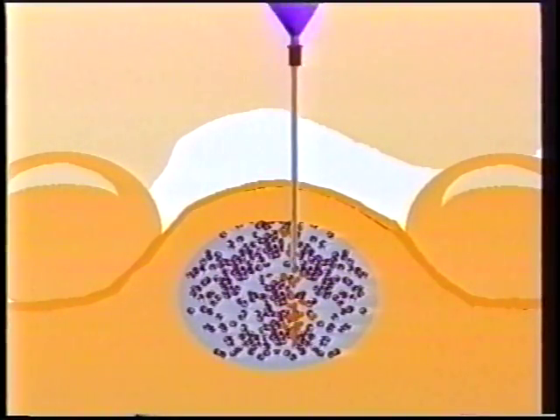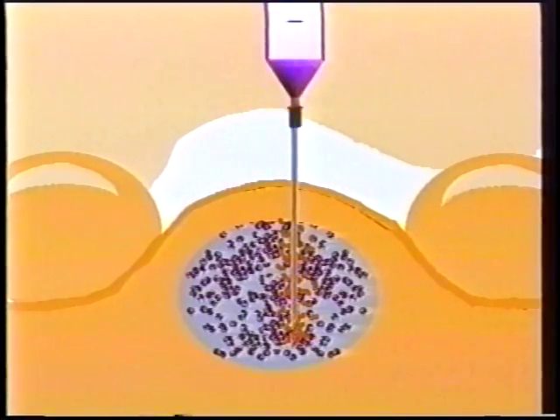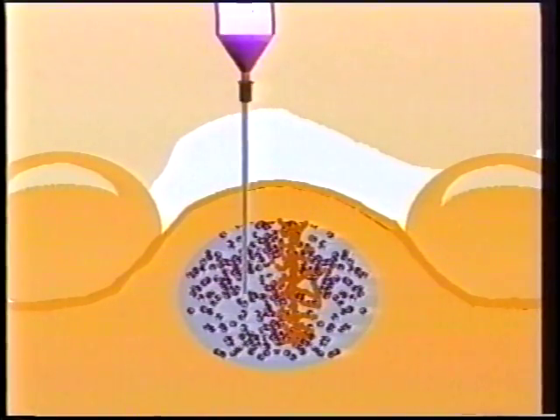Mixed with blood, there will probably not be enough time to smear everything before clotting occurs. Therefore, it is important to pick the most promising material first and make at least 1 or 2 good smears. If the material has already clotted, one may make a few smears and fix them in alcohol for better translucency than air drying. A cell button may also prove productive. Then repeat the thin needle aspiration biopsy, if possible, in a different part of the target where bleeding and clotting has hopefully not already occurred.